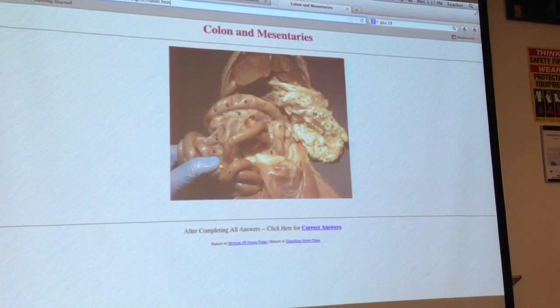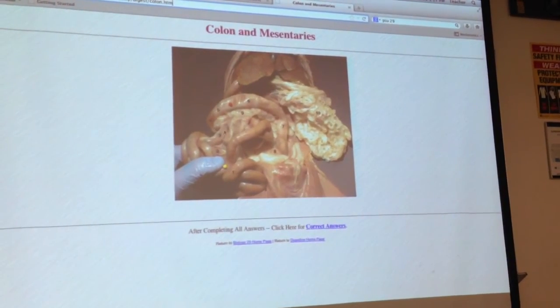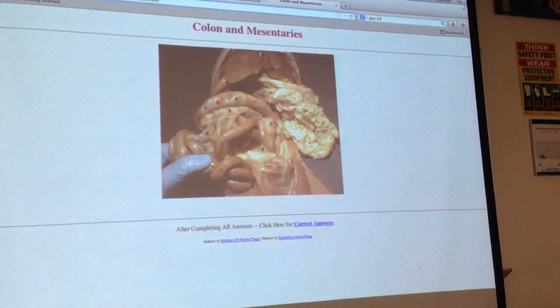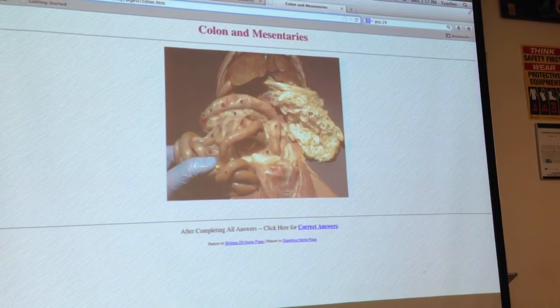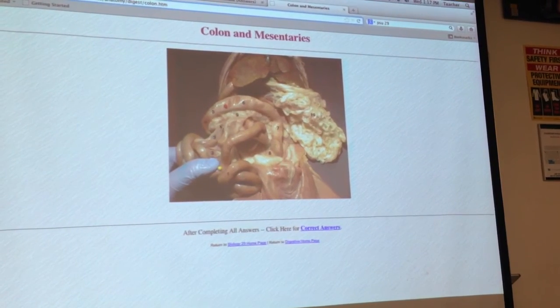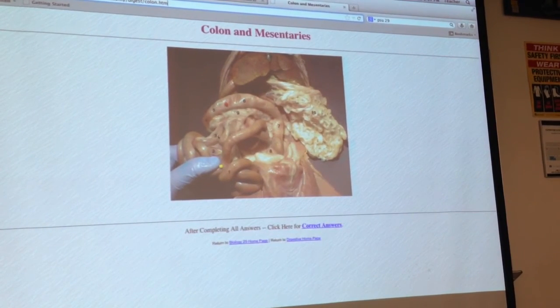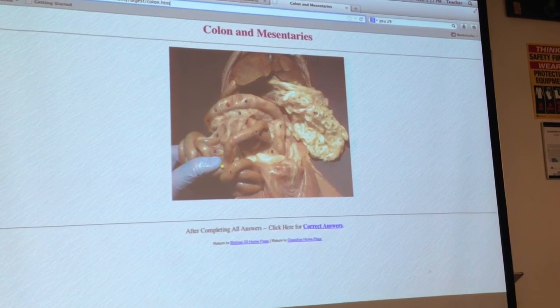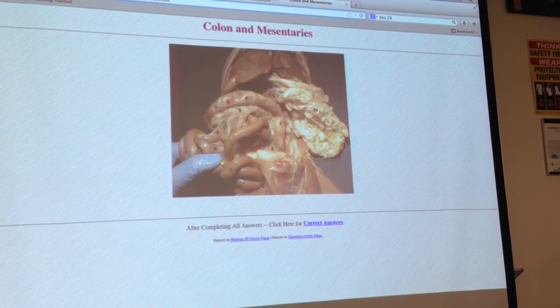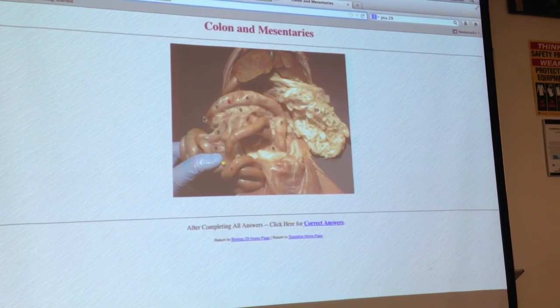So just to finish up the small intestine, if we're going to ask you for the ileum, we would pin it here where it's clearly in view of where it connects to the colon, all right? Now the best way to identify this spot right here as where the small intestine goes into the large intestine is because, just like we saw in humans, it doesn't go straight into the end, and it doesn't have a clean connection point. It goes in kind of to the side, right? So it would pop in right here, and it has this blind backwards pouch, the cecum.